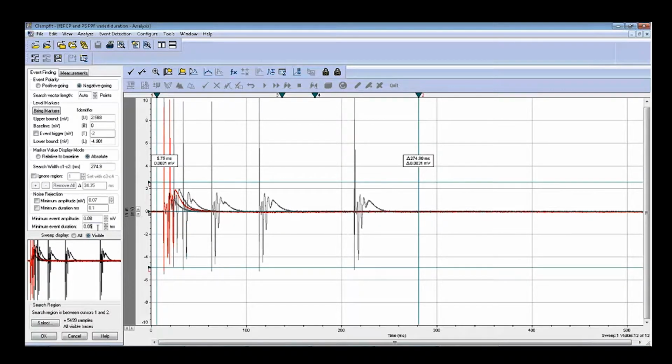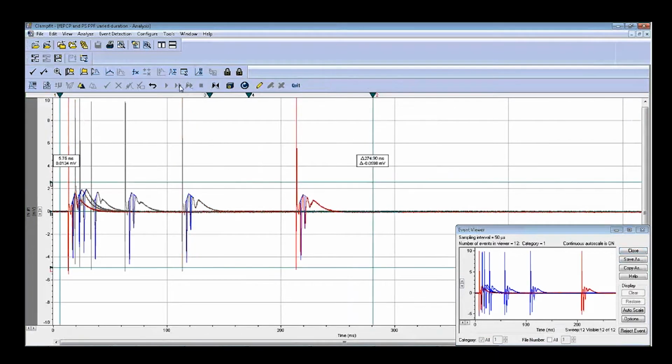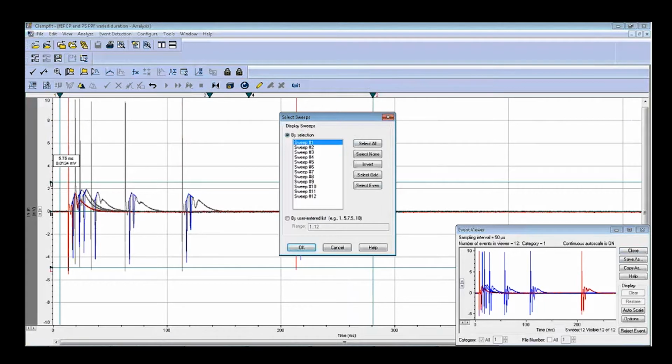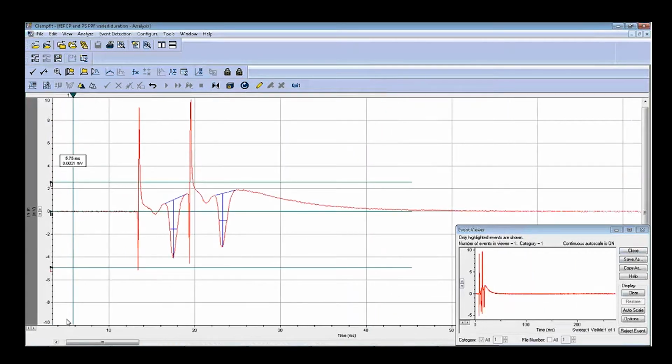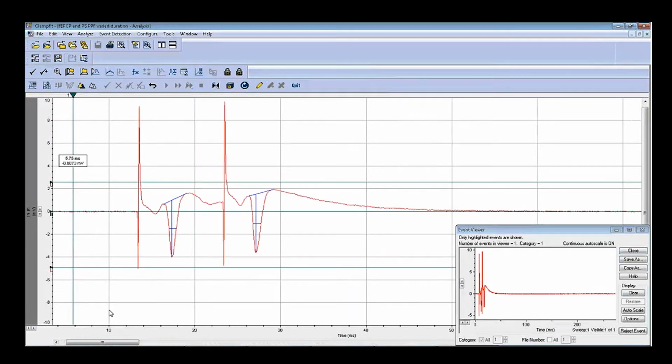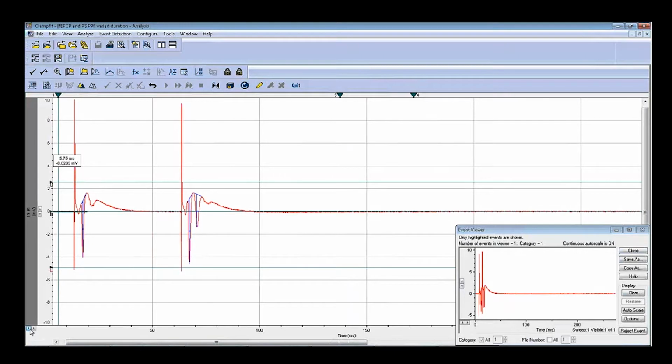Now at this time I put 0 here. I did this one before. You can put 1.5 there. 1.5. Okay. Now click OK. Hit this one. Wow, beautiful. You can see here. I just want to let you see each sweep. Right. Very good data. Very good.